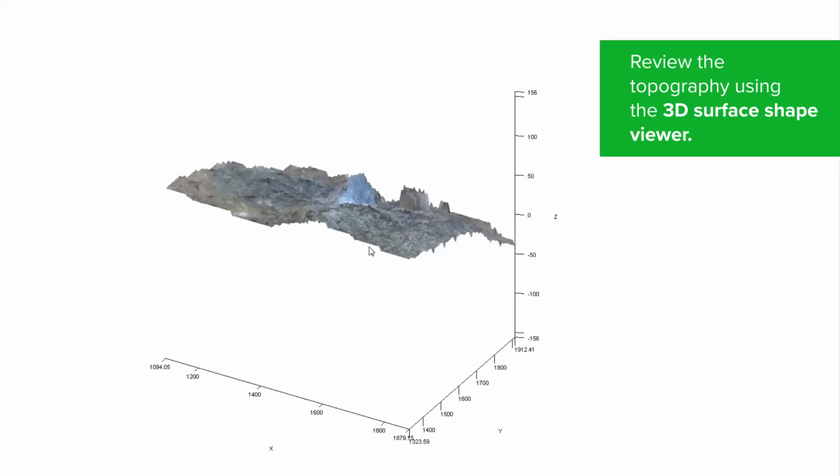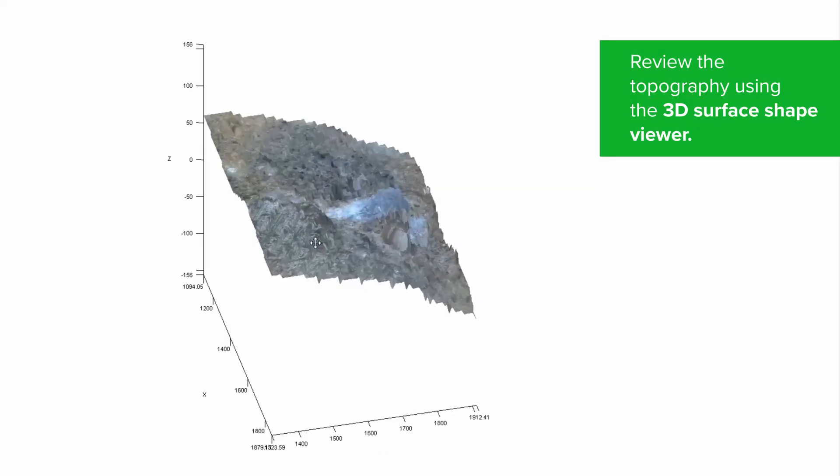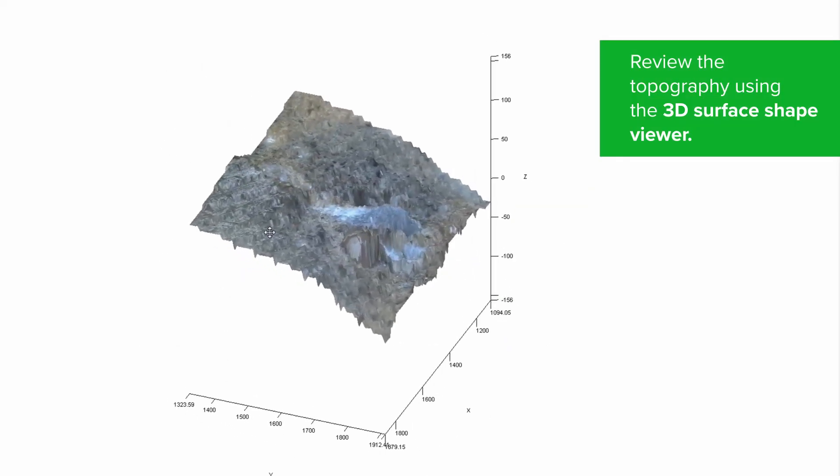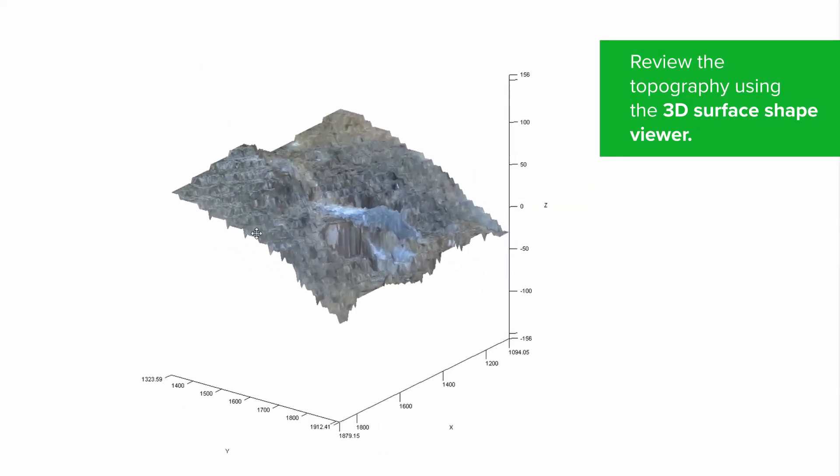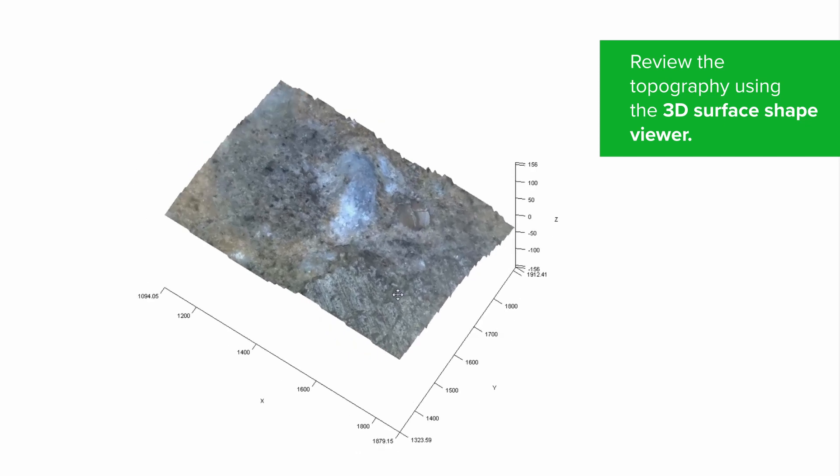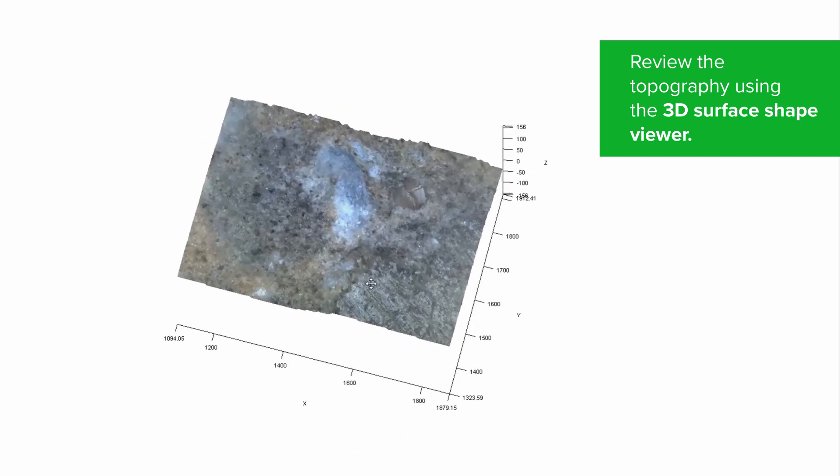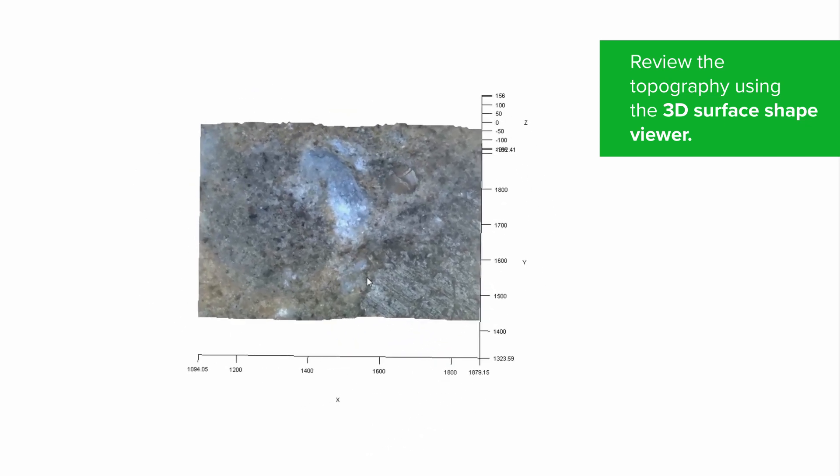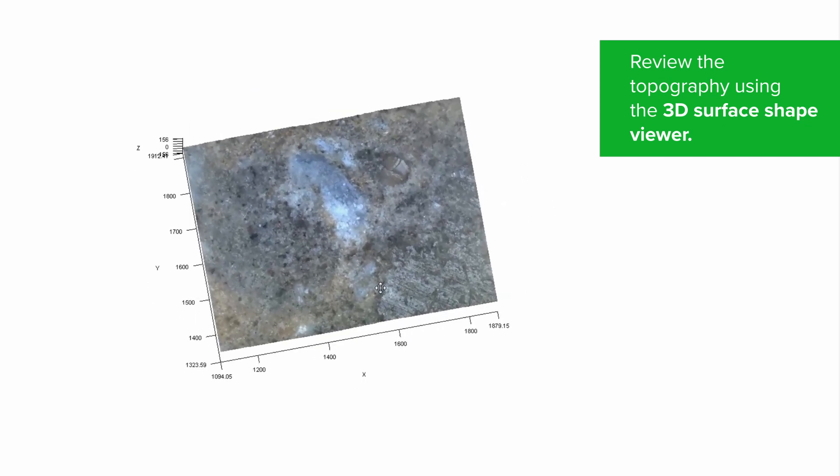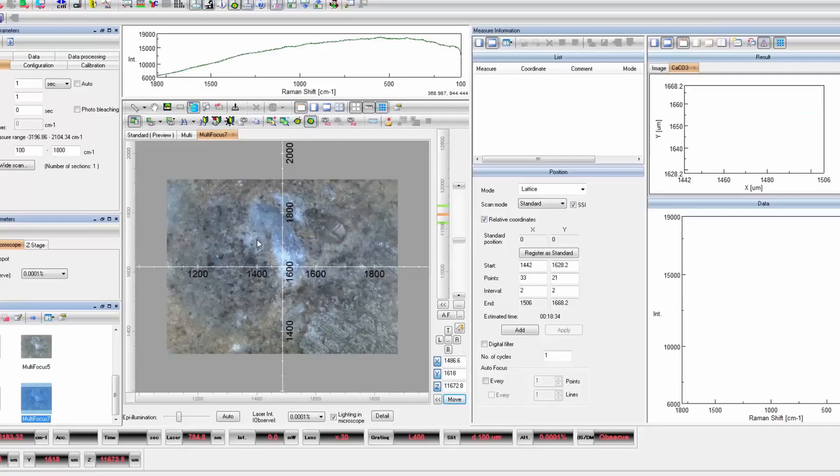The composite image can be viewed in three dimensions. This gives the user an opportunity to identify how much tilt and how much surface roughness is present in the sample being measured.